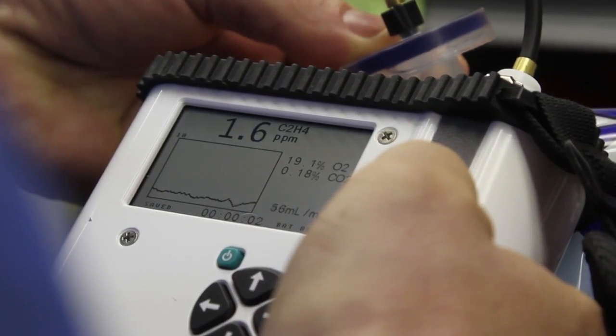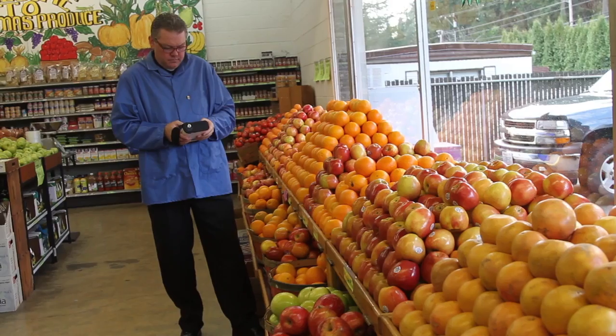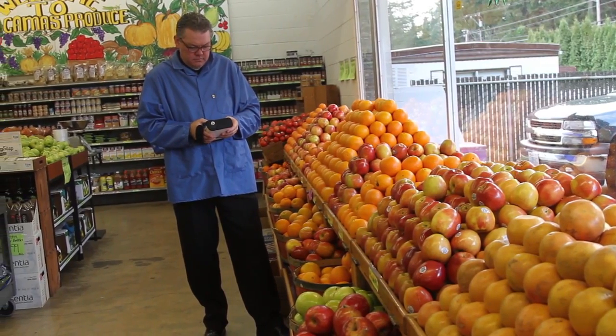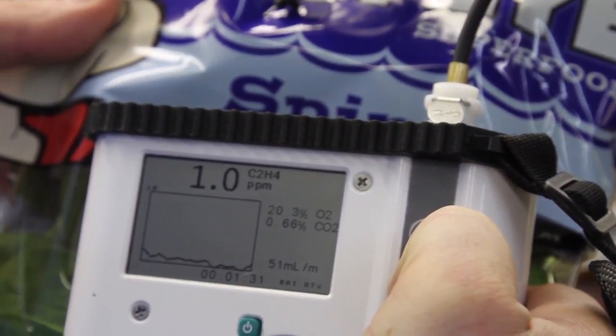Quality assurance for perishable cut produce demands a more comprehensive analysis. Most modified atmosphere packaging gas analyzers are equipped to only measure CO2 and or O2 measurements. The F950 handheld ethylene analyzer delivers all three.